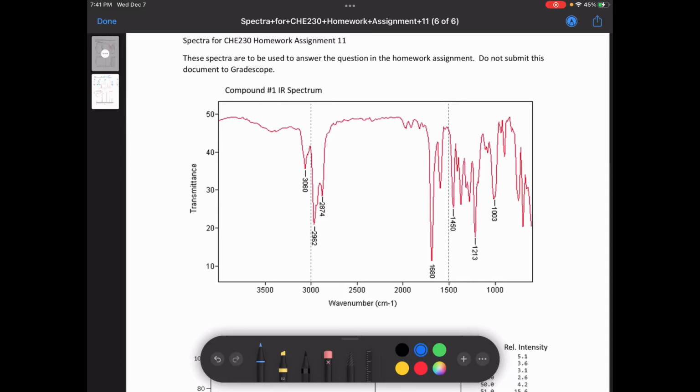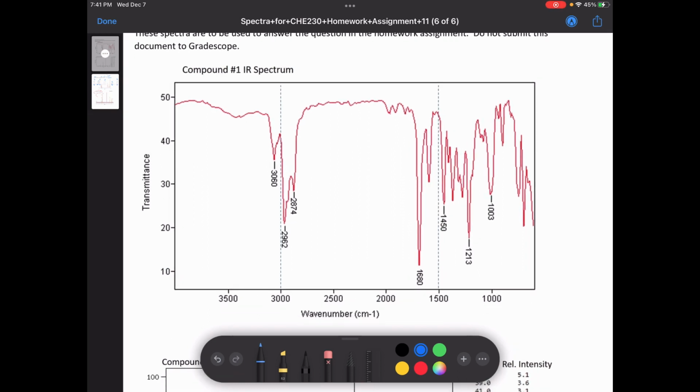Okay, so I'm going to try to go through this kind of the way that I do it. It is just in general kind of confusing, but I'll just do my method that I've tried to piece together. So first, I'm comfortable with IR spectrums. I'm going to look at the spectrum and try to figure out what I can tell from it.